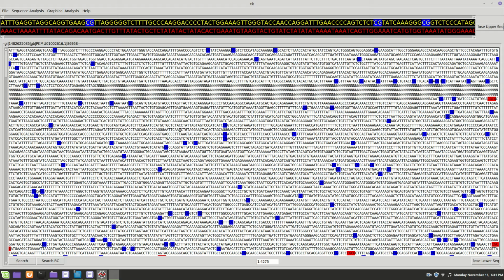The thing about this one is nobody's ever looked at these sequences. So these are brand new. But I'm going to show you how to get some clues by looking at organisms that are similar to this one. By getting clues from related organisms, we can figure out exactly where things are so you can test your analysis. Now this is pretty easy.